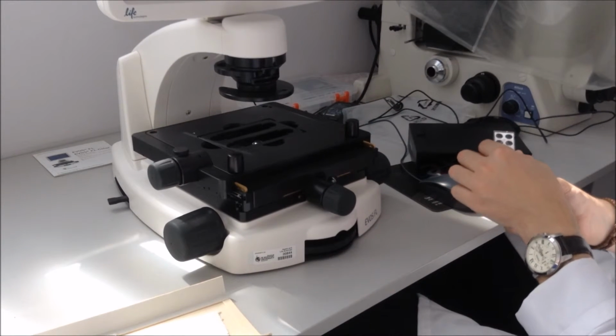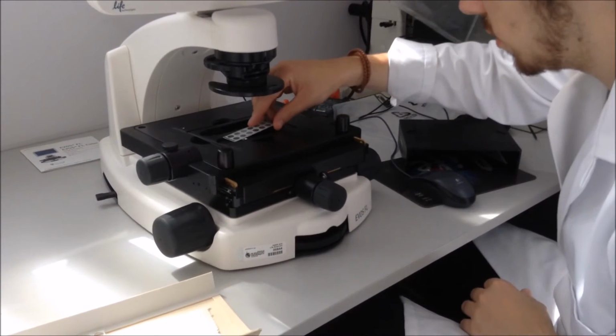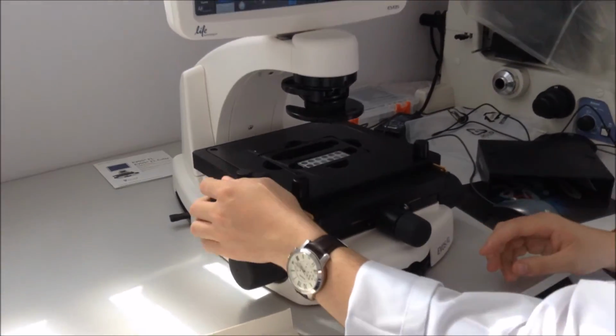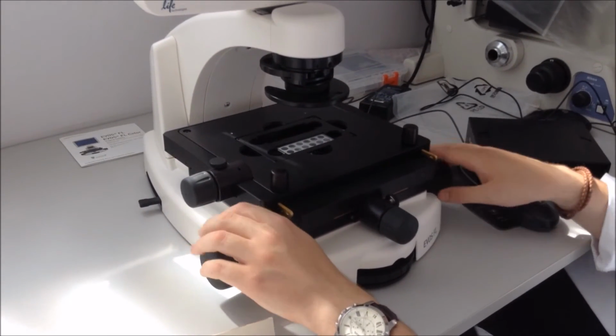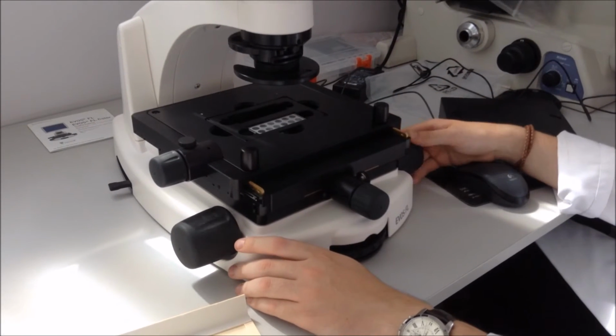When placing your sample on, make sure you place it right side up, as you do not want any of your sample to contaminate the bottom of the microscope. You can then use these dials located here and here to help move the stage, to help align your image, and you can then use the ones on the side here to raise the platform to help focus the image.